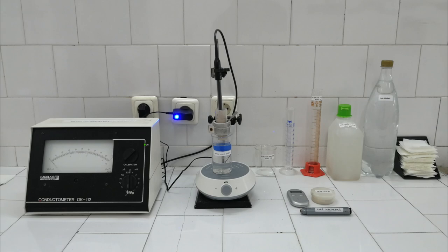When the experiment is finished, cast away the two solutions and rinse well with distilled water the recipients, the measuring electrode and the magnets. In order to protect the electrode and the membrane, before leaving the laboratory, fill the two containers with distilled water, put them in contact and dip the electrode into the internal container.